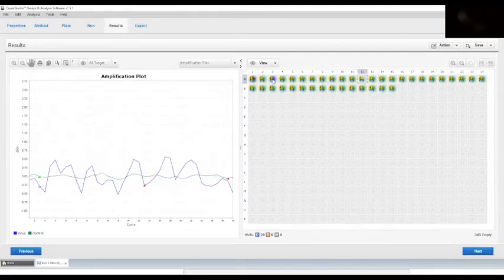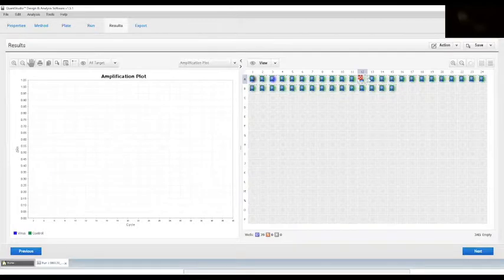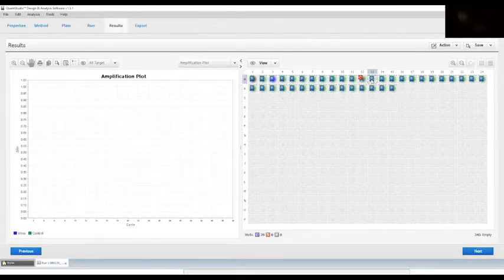There are several samples which had some bumps. Once you find them you should omit them because it would prevent the analysis from being correct.